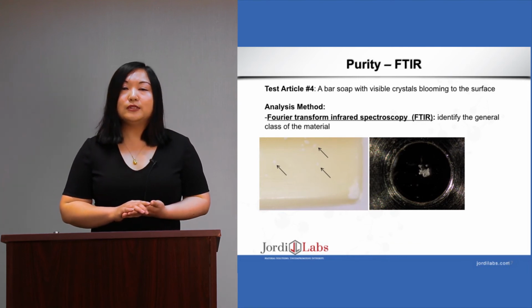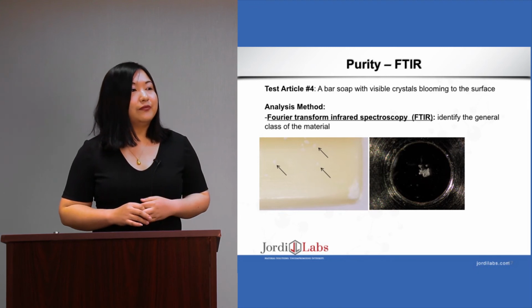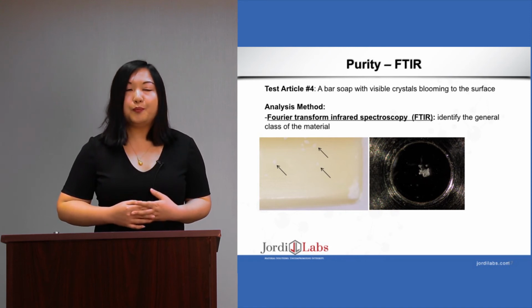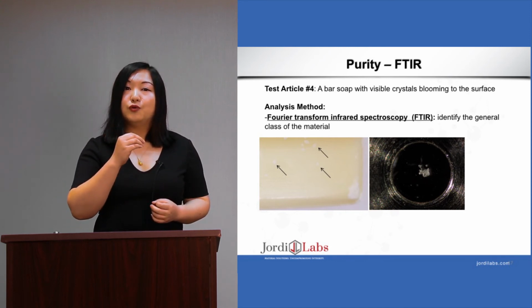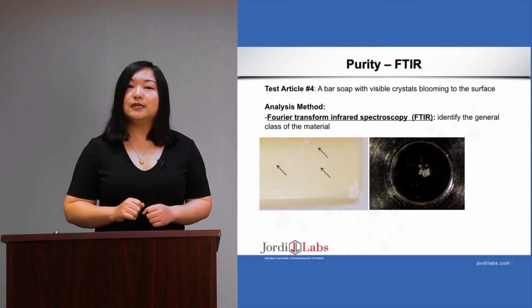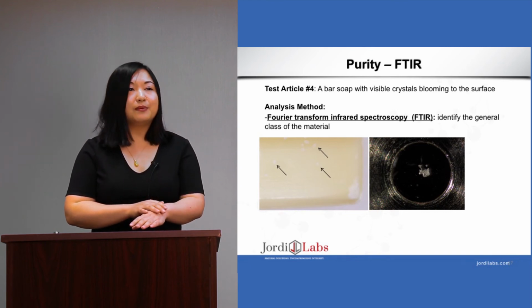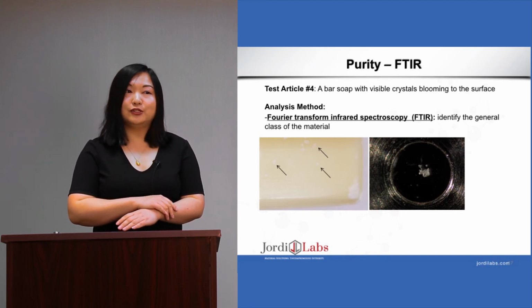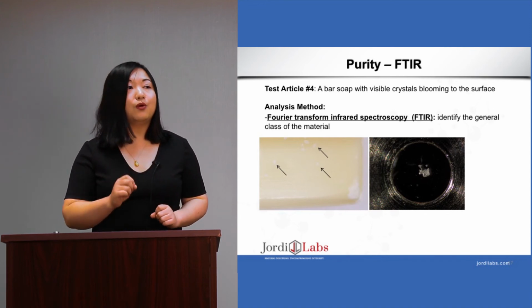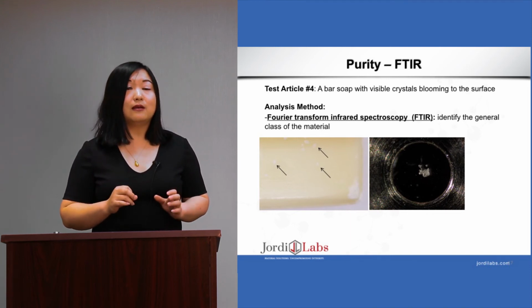Another quality control type of testing we can do is the purity test. This is actually a project we got from a bar soap, where they observed some crystal-looking particles on the surface of the product. When the customer used it, it was reported to have an uncomfortable sandpaper feeling when you rub it against you. So the purpose of this project is to find out the chemical components of these crystals, what they are.